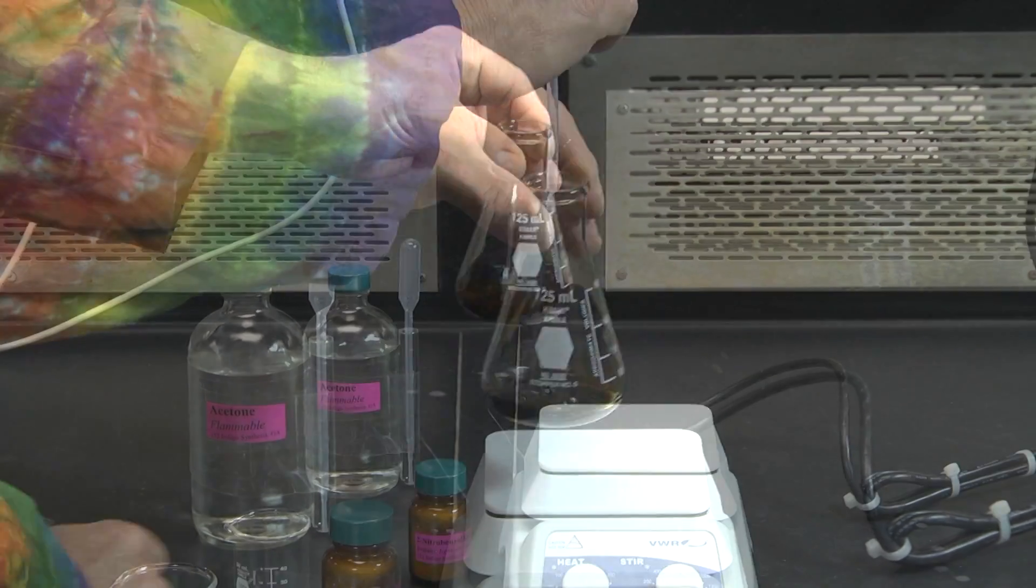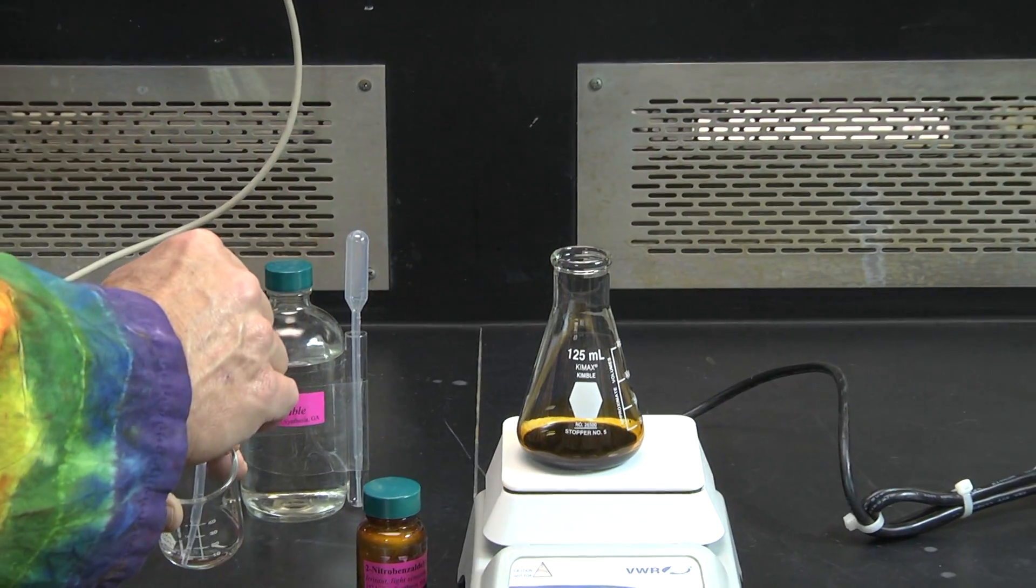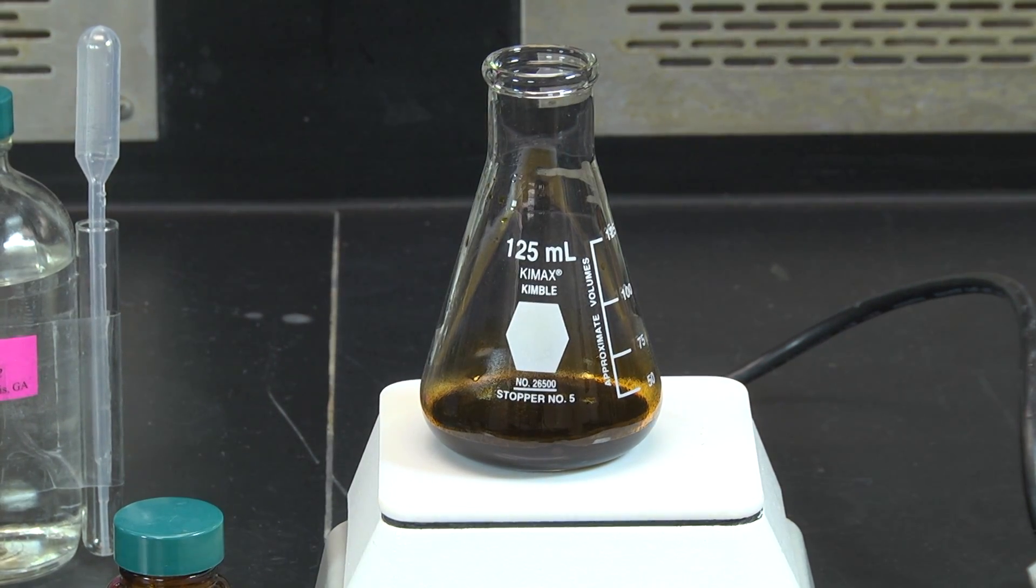Since the reaction is exothermic, you should also notice the bottom of the flask getting warm. Allow the mixture to sit for 5 minutes or so at room temperature to allow the reaction to come to completion.